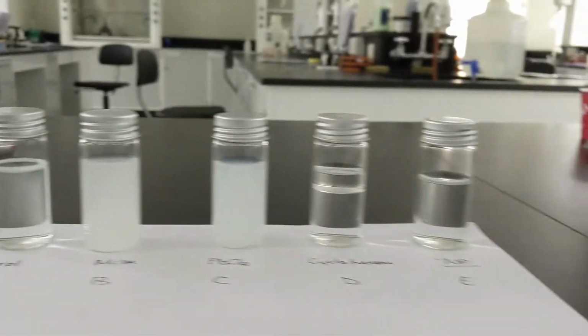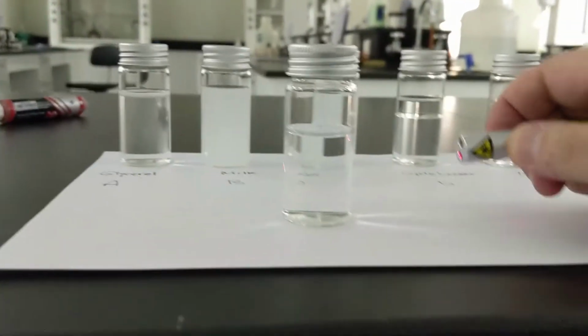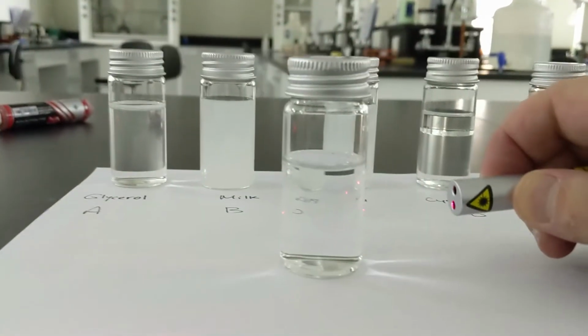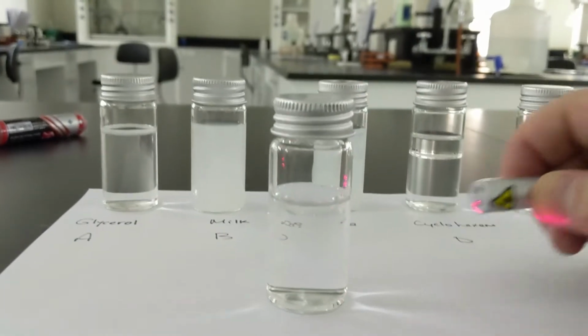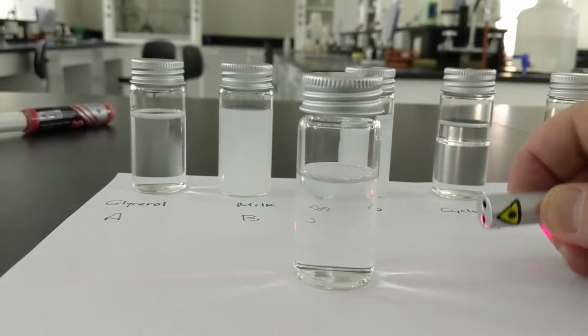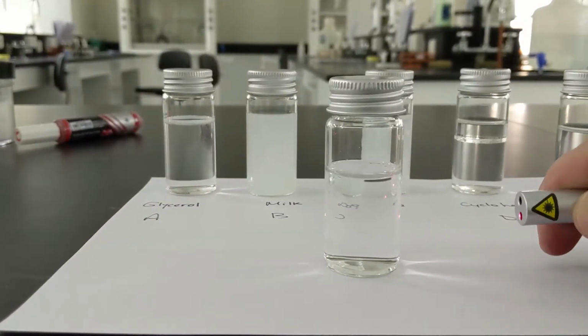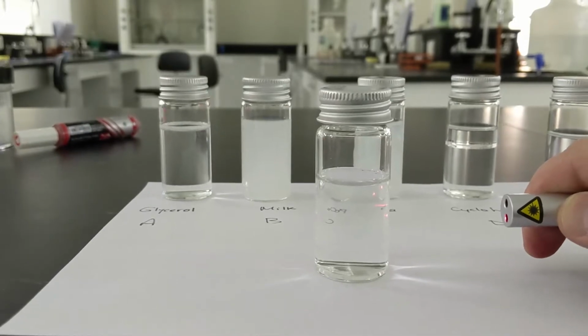Okay, so I've shaken up all these solutions. I've turned all the lights down. Let's see what happens. Now, first, this is just water. What does water look like when we shine a laser through it? Nothing really, right? You can see the laser hitting the glass, but you don't see a line going through that solution. So this is what water would look like. You can see the laser on the left side and the right side, but that's about it.